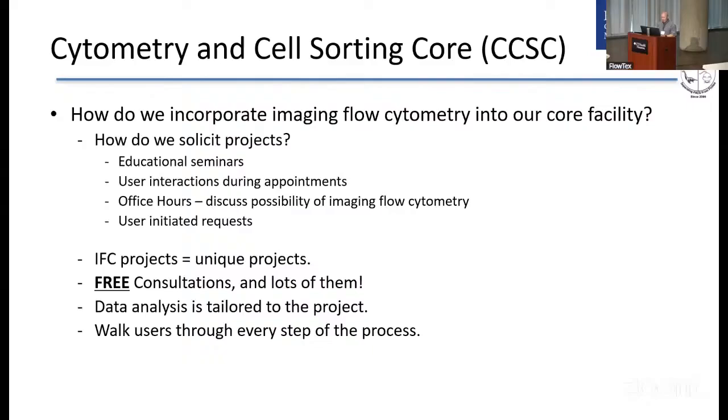On a side note, we now have some users that are starting to take advantage of large language model AIs like Copilot, ChatGPT, and that's actually dramatically improved the capability of custom data analysis outside of vendor-provided software. So that's something to keep in mind, something that wasn't even available really a year ago or widely even thought about, that if you're approaching IFC and you have a question that maybe you can't tackle with the vendor-provided software, you can start delving into these large language model AIs.